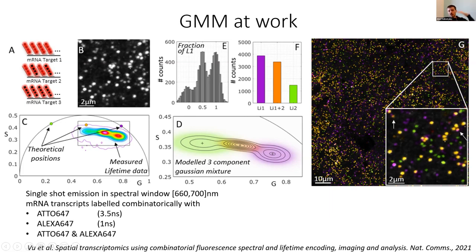This is actually a 3D Z-stack, so I'm just showing the projection as you project down. But for example, here, this one marked here is actually 2 that are very close. So you're getting 2 transcripts that are so close that they overlap, and then you start to see uncertainty in your data. And this goes to the second half of the talk, which is about mixing this data.